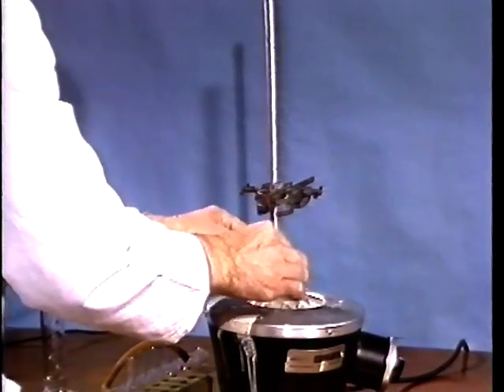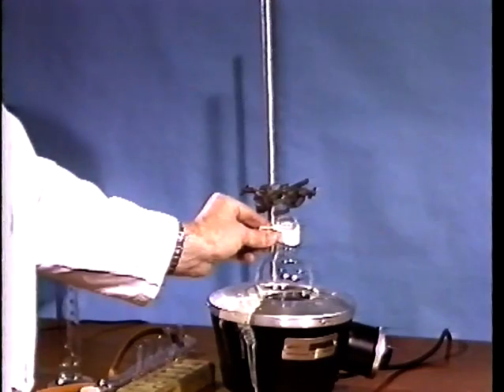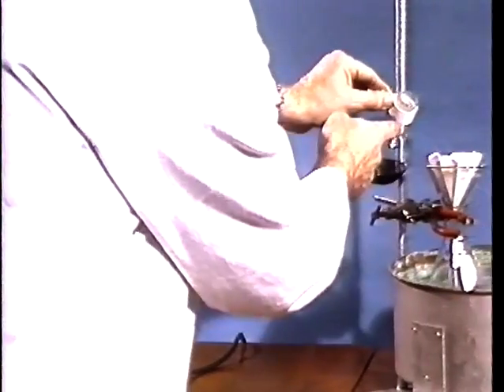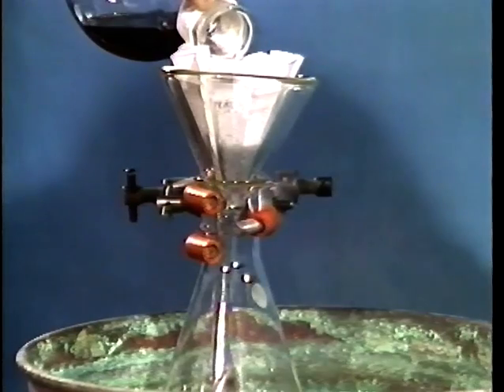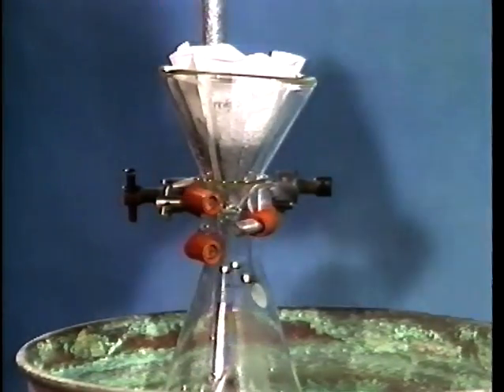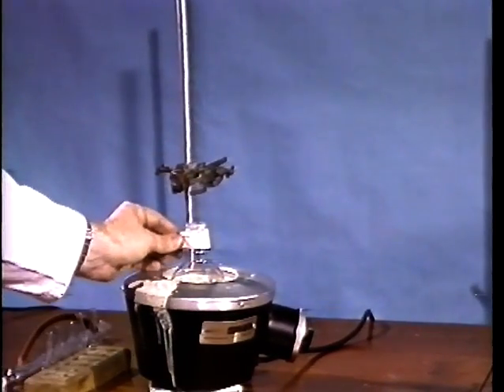Put the flask back into the mantle briefly to rewarm it. Pour a small amount of the hot solution into the fluted filter paper. Replace the solution in the mantle to keep it warm.